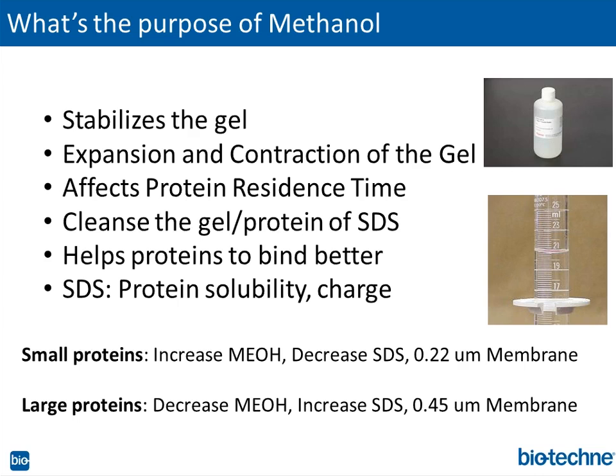So maybe 5 minutes in the transfer buffer, then make your stack. And of course, when you make your transfer stack, you don't want to crush the gel. You want to get rid of all the air bubbles, because if there's any air where your protein is, proteins don't travel through the air. I don't know if you know that or not, but they don't. So they've got to be in a buffer environment. Making a nice tight stack is really important. So that's the second thing that methanol does. It basically cleanses your gel and gets it ready for prime time for your transfer.